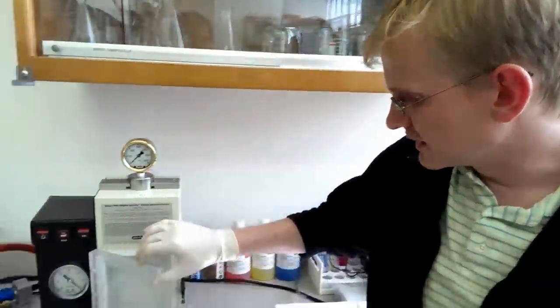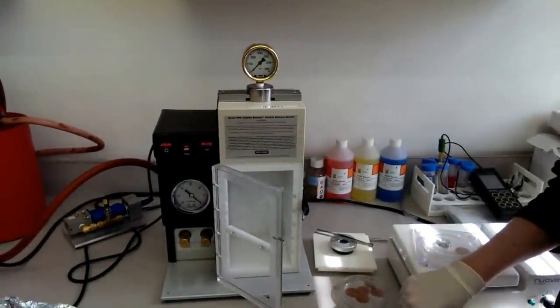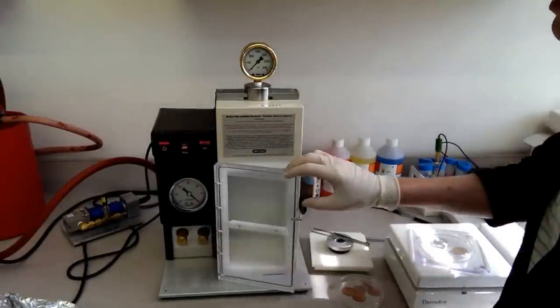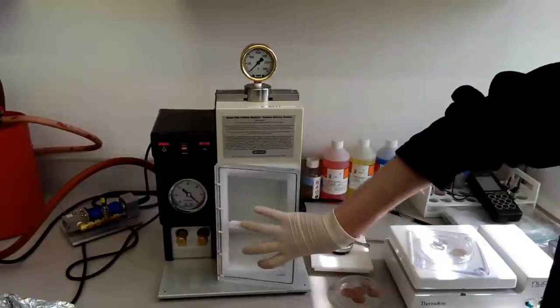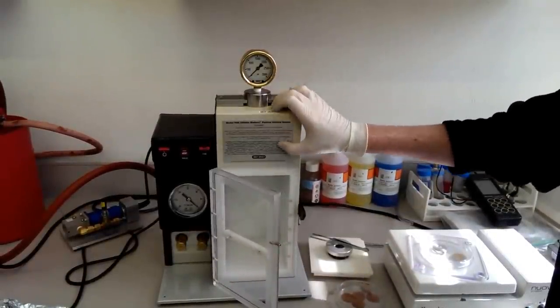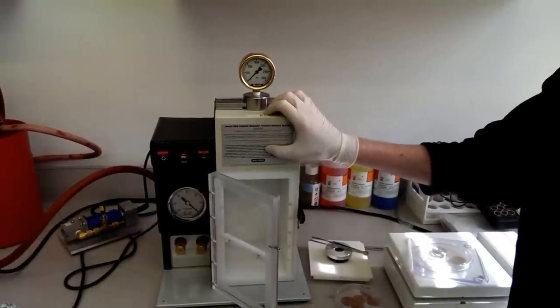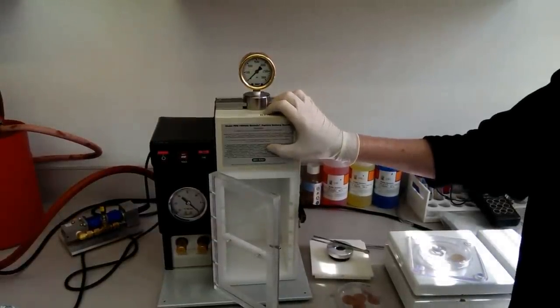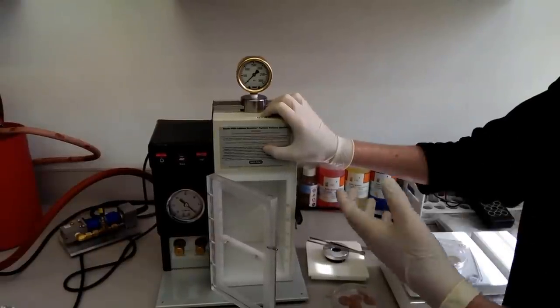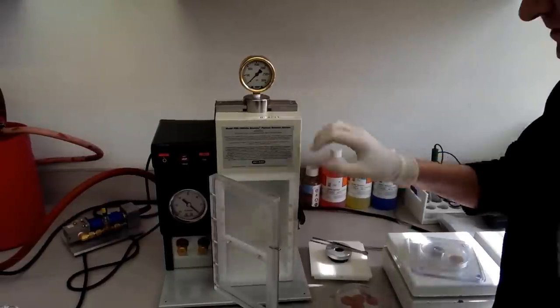So here's the machine here. I'm going to walk you through the steps, basically, of how you set it up, and then we'll demonstrate it firing as well. On a high level, essentially what's happening is you have a vacuum chamber here where all of your stuff goes. Up here you have a pressure chamber where the helium will build up pressure to a certain point that will then break what's called a rupture disk, creating a shockwave and then projecting the DNA down into whatever plant tissue or cells you've got below.